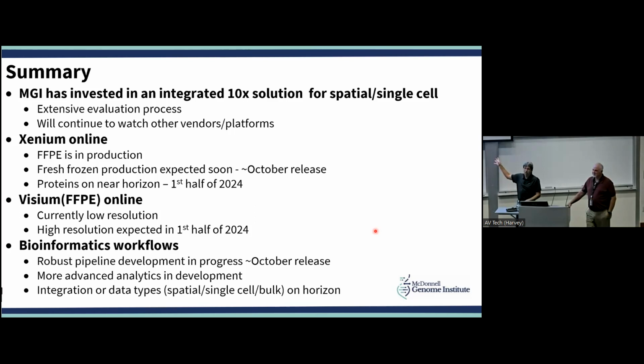So Visium is untargeted. Visium is whole transcriptome. Xenium is targeted. Xenium is all targeted. Yes. Visium is whole transcriptome. It's untargeted.